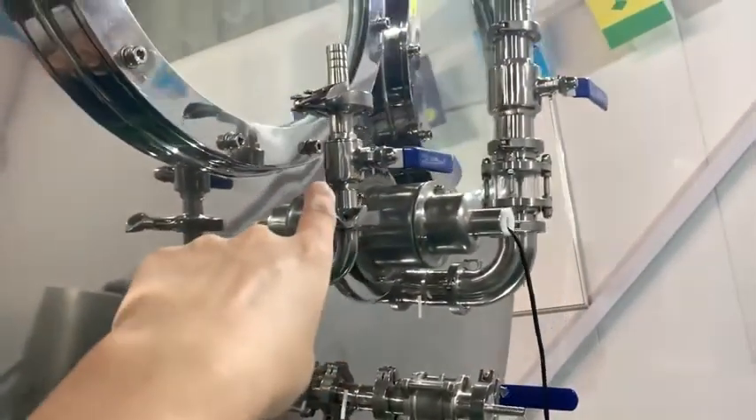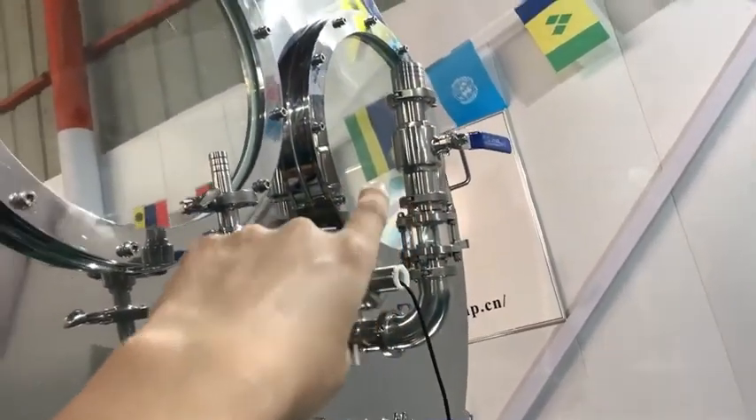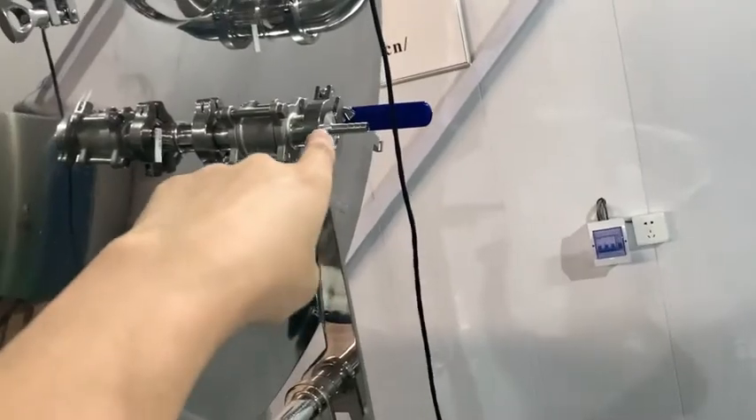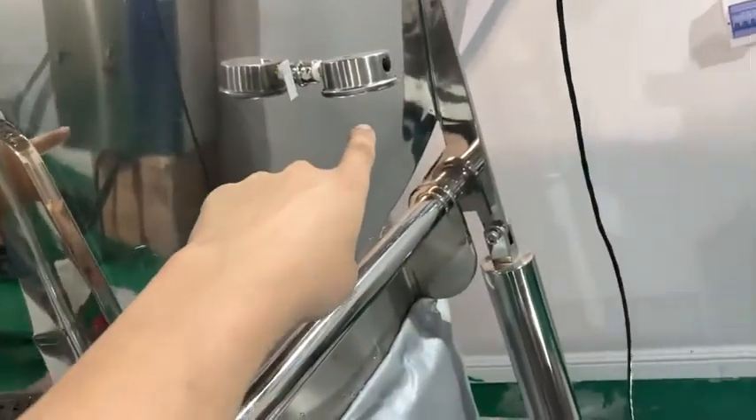This is a resin pot. And this is an ethanol feeding pot. And this is a vacuum suction. And this is a vacuum gauge.